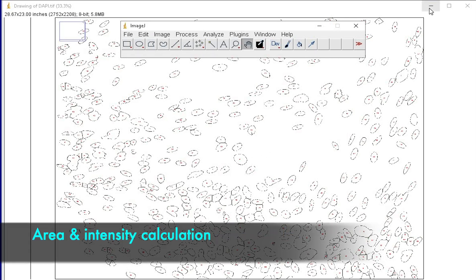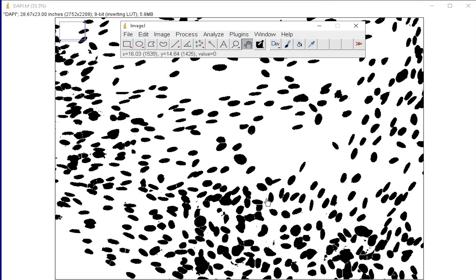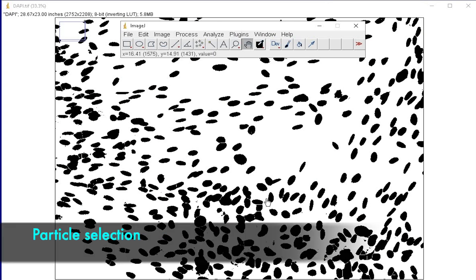Now, let us analyze the area and the intensity of the cells stained with DAPI. To do this, first, let us select the particles to be analyzed.